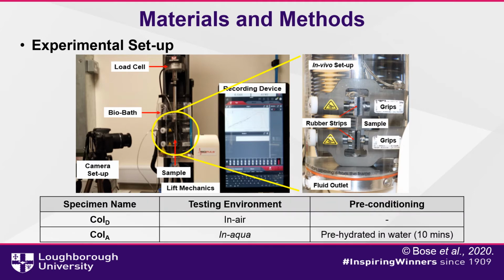In the upcoming slides, collagen films that were tested in air would be designated as COLD, while those that were tested in aqua would be designated as COLA. In aqua samples were prehydrated for 10 minutes before testing.